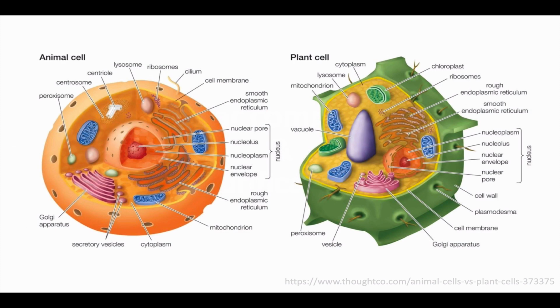So consider an animal or a plant cell that you've seen before. Look where the nucleus is in each case. The nucleus is where the genomic DNA is housed, and that's what we need to isolate away from every other aspect and component of the cell.